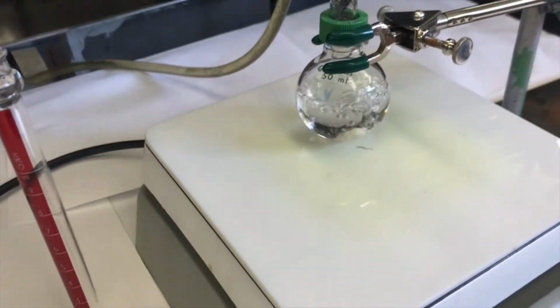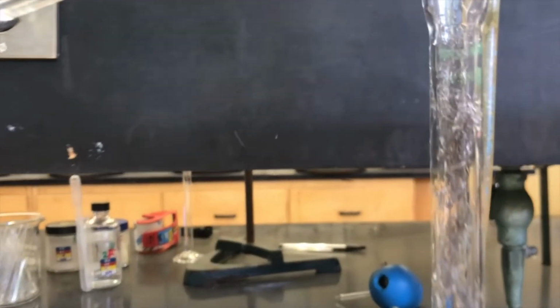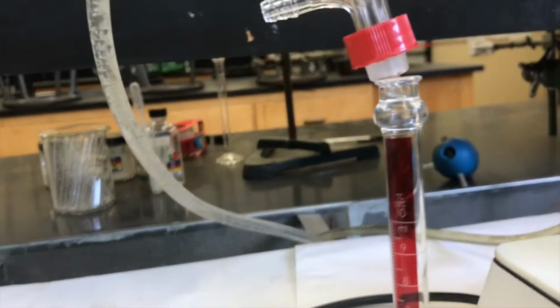Now it's boiling good. And let's see, yeah, it's working its way up the column. Look carefully, I see solvent dripping there. Oh yeah, it's already starting to come over. I'm going to turn down the temperature a little bit, go to 300. And let's see, are we going to see our first drops?